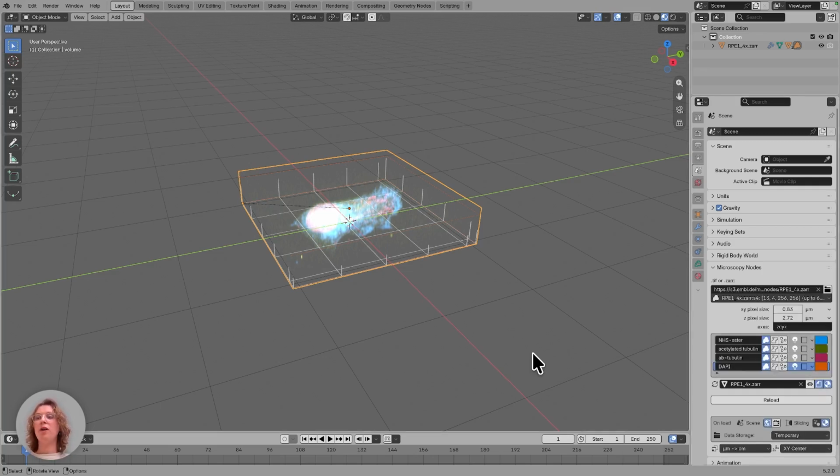But there is still the issue that we often have with our large data, that we don't actually care about the resolution of the complete data set. And so for this, we have masked sparse reloading, where we can select a region and only load that specific region at a high resolution. And this is all under this I button, but to first get there, we need to first build a mask. I have a longer tutorial on more advanced masking, but for now we will just switch to geometry node slicing and reload our small data set.